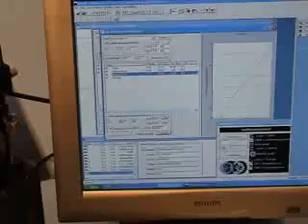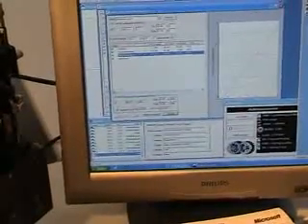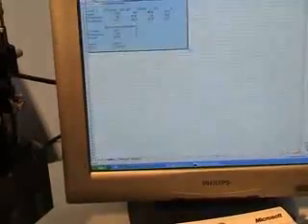At the same time, we have also activated Excel in the background. When we have a look into the Excel file, we see the report for the surface energy calculation on this point. Of course, more transfers of those data can be done into Excel.